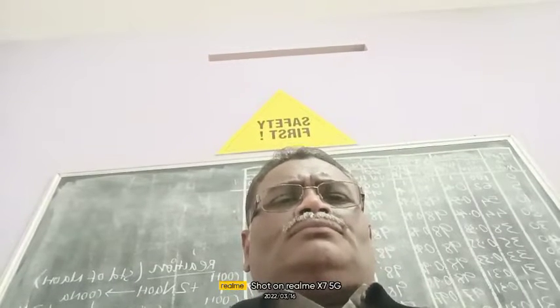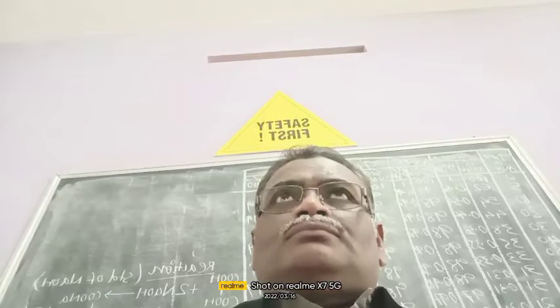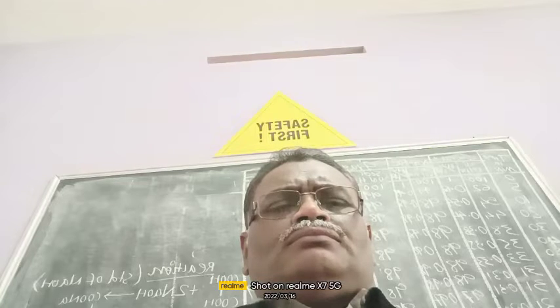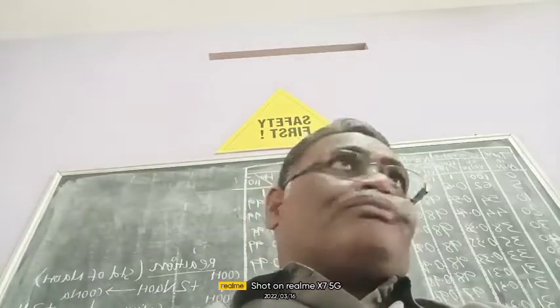Easily see the level of heat. Understand? Easily you can see the difference in the turbidity. Then you will understand how you can exactly analyze and find out the consistency using the sedimentation. You are listening to your madam's explanation, right?